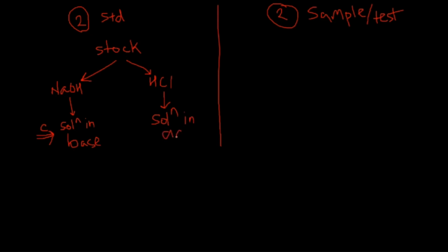That is solution in acid. Please remember the concentration of both the solutions are same. Okay, if my drug is acidic drug, right? So somebody will unmute and tell me so I can hear your voice, that if my drug is acidic drug like paracetamol, will it show more absorbance in NaOH or it will show more absorbance in HCl? Unmute and tell me. Sir, more absorbance in NaOH.